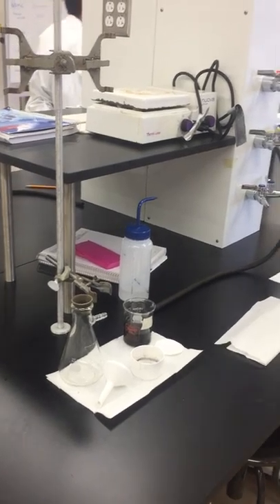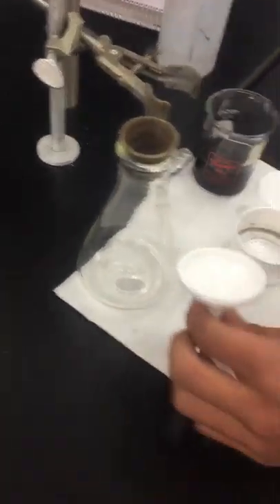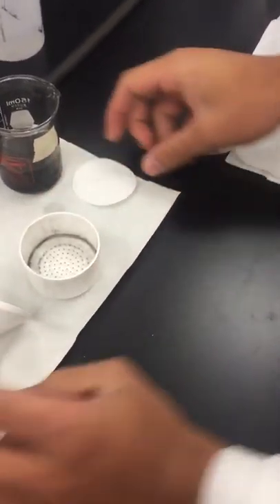Today we're going to be learning how to properly assemble and use a Buchner filtration system. The main components of this filtration system are your filtration flask, your adapter, your Buchner filter, your filter paper, your tube, and your vacuum system.